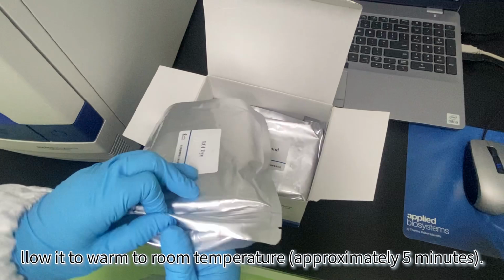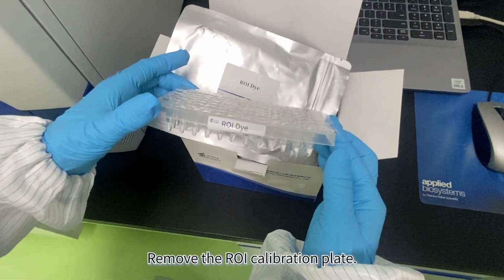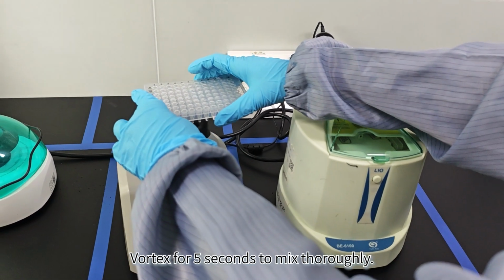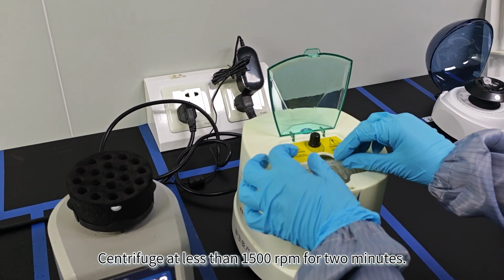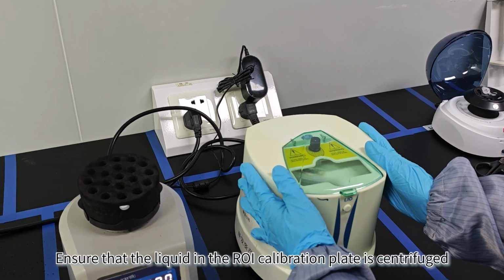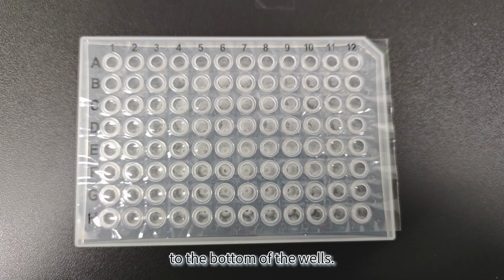Allow it to warm to room temperature. Open the packaging. Remove the ROI calibration plate. Vortex for 5 seconds to mix thoroughly. Centrifuge at less than 1,500 revolutions per minute for 2 minutes. Ensure that the liquid in the ROI calibration plate is centrifuged to the bottom of the wells.